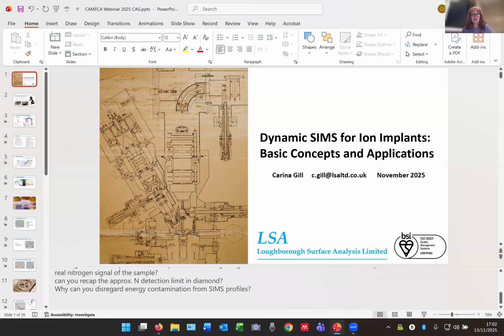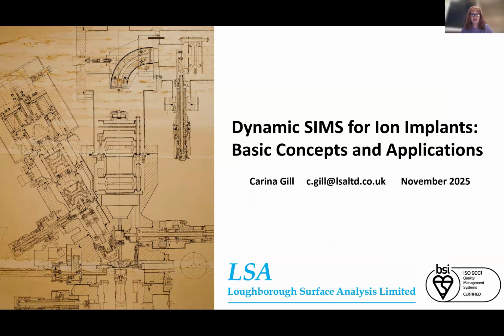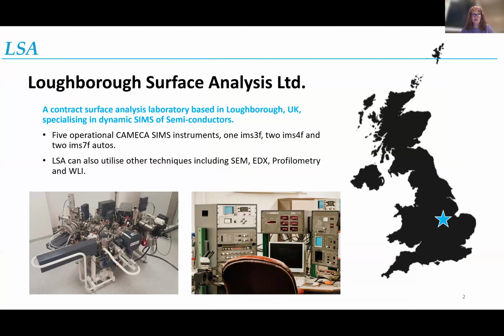I'm here to talk to you today about dynamic SIMS and how we use ion implants to quantify data, and some of the pitfalls that we can come across when we are using ion implants and how we quantify them initially. So, as Paula said, I work for Loughborough Surface Analysis.